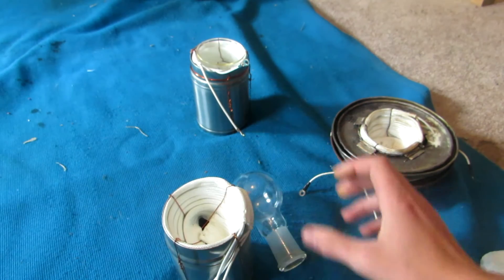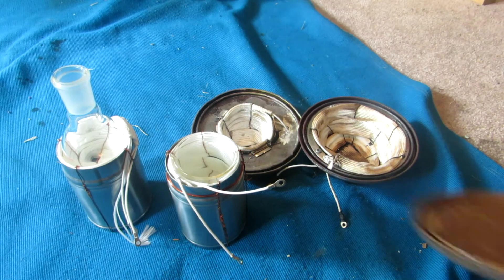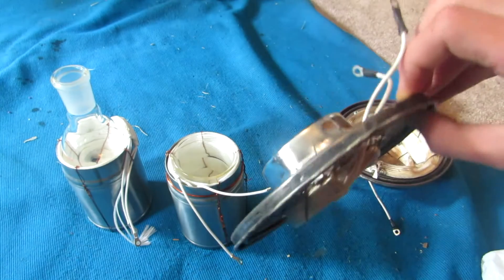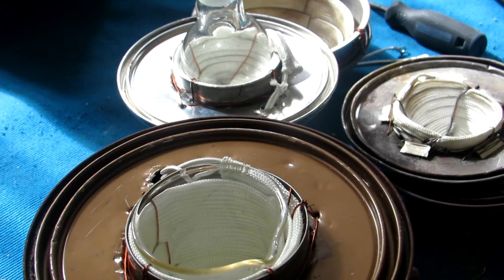A second thermos was also prepared in the same way to accept the round bottom flask. Next, the thermoses must be attached to a paint can lid so that they can be interchanged with the other sizes of heating mantles. This was done by simply cutting a hole in the lid, and then using wire to hold them in place.